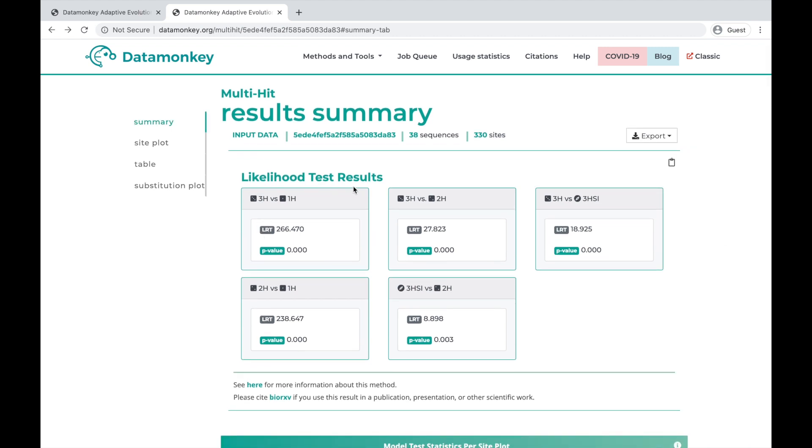Starting off, we see the likelihood test results. When MultiHit runs, it performs several pairwise tests of models against each other, and the results are displayed here. This is the pairwise likelihood ratio test for the triple-hit versus the single-hit, for the double-hit versus the single-hit.